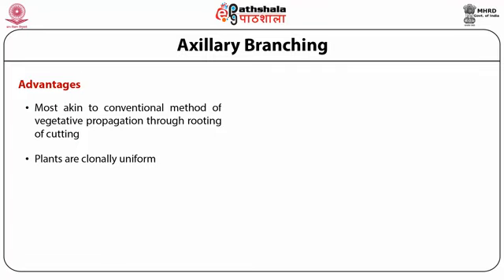Due to the continuous presence of cytokinin in the media, the shoot developed from the axillary bud present on the nodal cuttings at the time of culture develops further axillary buds which grow directly into shoots. This process can be repeated several times and the explant gets transformed into a cluster of branches.